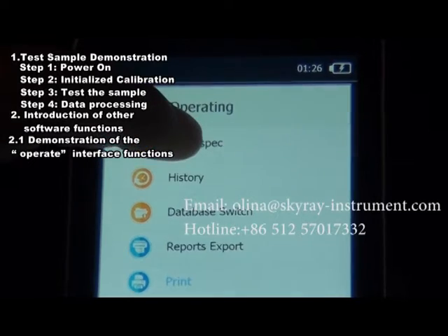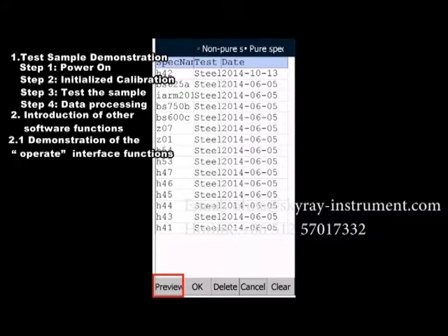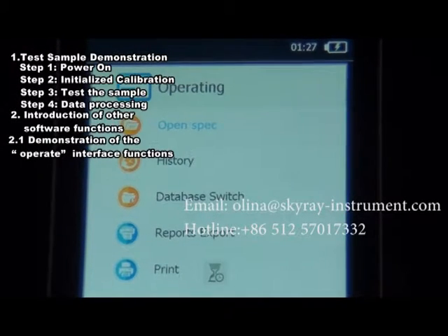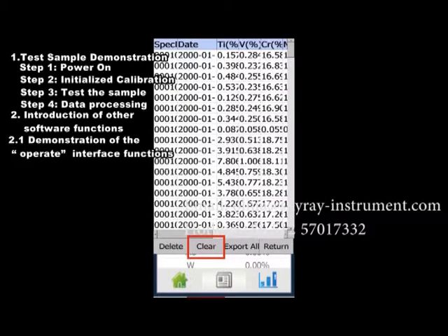Section 2.1.1: Open Spectrogram. Click Open Spectrogram to view previously scanned spectrograms. Select a spectrogram and click Preview to preview its shape, or click OK to view the test results of that sample. Section 2.1.2: View History. Click the History button to view history records and carry out operations such as Delete, Clear, or Export. Select a spectrogram and click Delete to delete it, or click Clear to clear the data. Note that spectrograms of standard samples cannot be deleted or cleared. Click Export to export the spectrogram data.